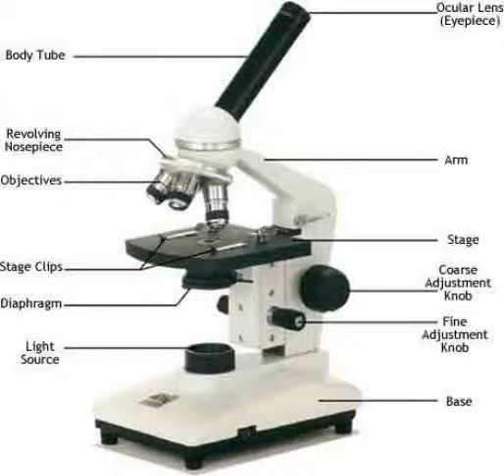The microscope rests on a large, stable base. The image is viewed through the eyepiece. Microscope slides are placed on a flat surface above the base called the stage. The stage is attached to the base on a vertical arm. On the stage are clips that hold the slide in place. In the base is a lamp called the illuminator. This adds additional light to the image for easier viewing.